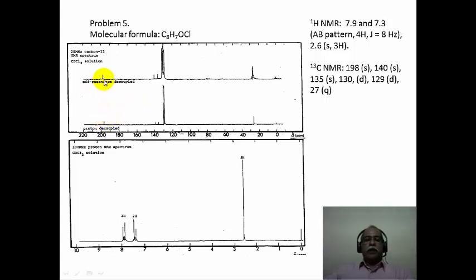So this essentially indicates that this carbonyl functional group is not an aldehyde, because if it were to be an aldehyde, it would have been a doublet signal here. The CH would have split the carbon signal into a doublet. Since this is remaining as a singlet in the off-resonance spectrum also, this is likely to be a ketone. Since we concluded this could be a COCH3, that is sort of confirmed by the presence of this particular signal being a singlet signal corresponding to a ketonic kind of a signal.